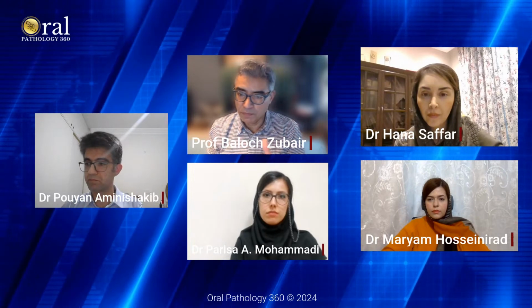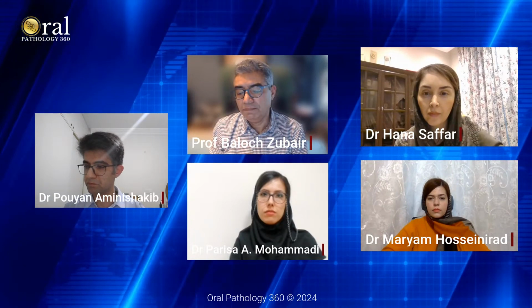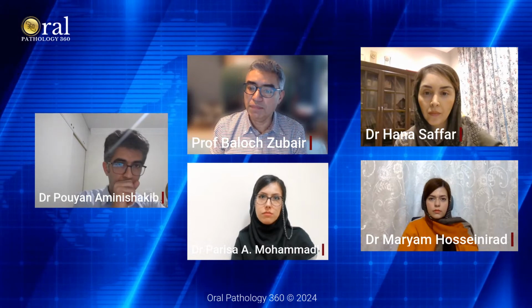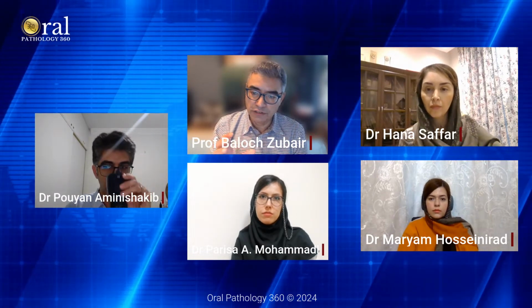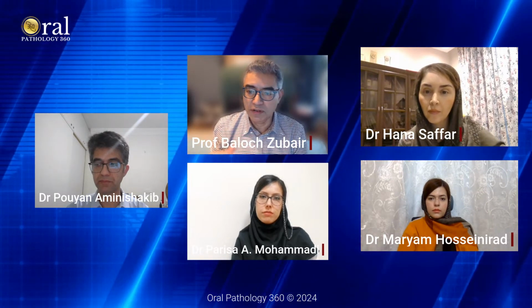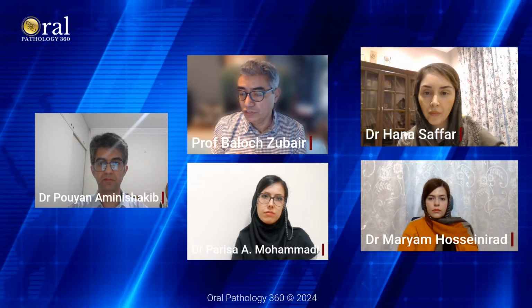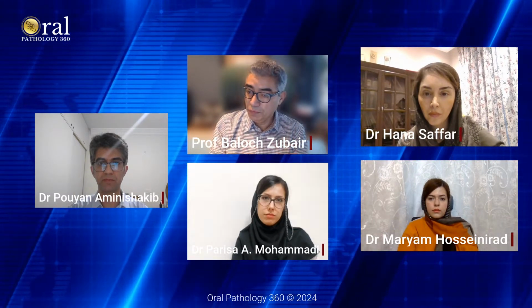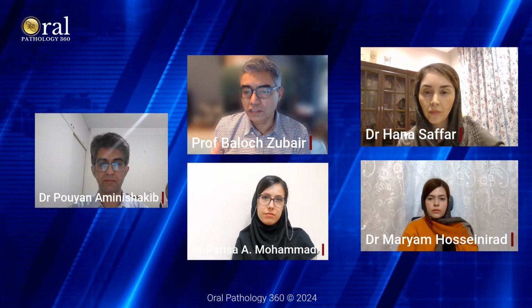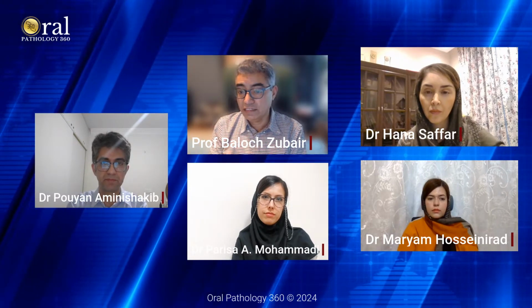And I'm talking about common benign tumors and some of the common malignant tumors. If you are on site and you're not getting enough cells, and you think that what you're putting in the cup is going to have more than what you're seeing on site, that is always wrong. You have to be very judicious on how much specimen you put on the smears, because sometimes the smears have everything and you have nothing in the cup to do special studies or look further, because every stain provides different information.